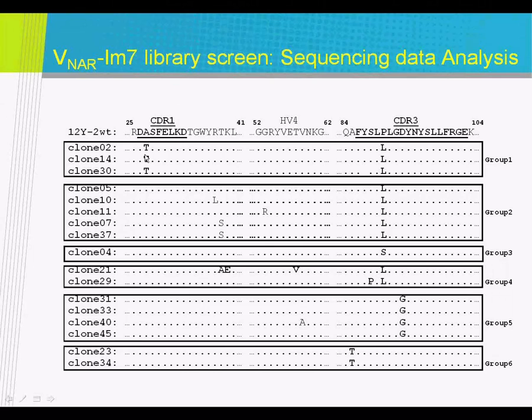So we were extremely pleased with this result because it could pick up very subtle differences in our kinetic profiles. This assay was able to distinguish, and the assay was done with the crude samples. The differences are minor, but are significant in terms of these mutations.